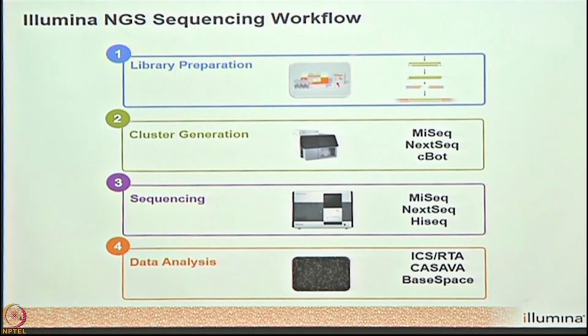The very first step involved in all the sequencers is library preparation, which is followed by cluster generation. Then comes the sequencing, and the final step is the data analysis part. Okay, so first is the library preparation. It's common for all the platforms. Though the sequencers are different, the concept remains the same.